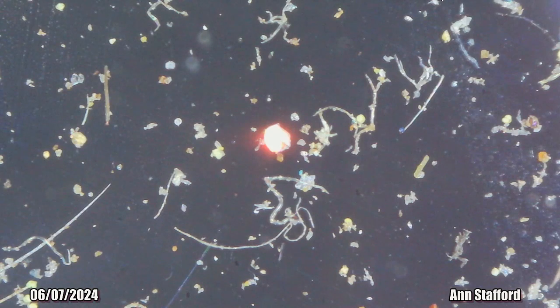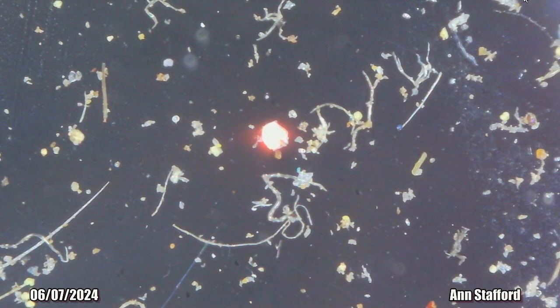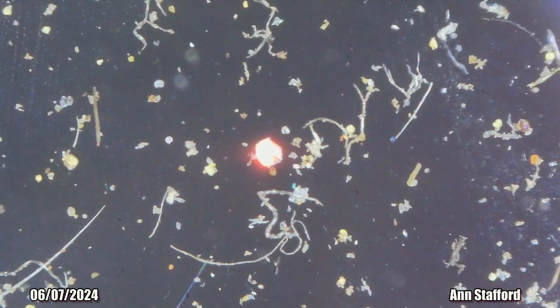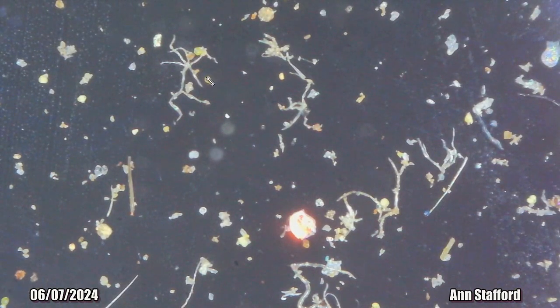So the question is, why is this one glowing? I have no idea, but it's glowing and it's interesting. So I'm just going to take a couple of screenshots of it, and I'm going to have to move on. It's under the glass. I don't think it's going anywhere, but I have had a couple of things disappear where I was like, where did that go? See this one? There's the head, and then it's got this long piece. Now that could be a tentacle, or it could be the body. I'm really not sure about that.